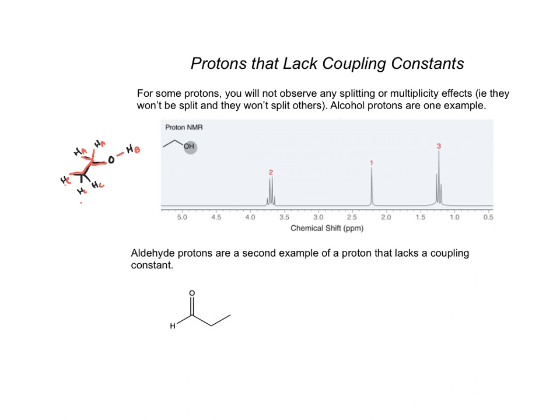Now, unfortunately, you would think that, and you would be wrong, because these protons on alcohols, so these guys, do not split any other signal. Okay, so just note that. They're not going to be split, and they will not split anybody else. So our HAs are only going to be split by the HCs over here.